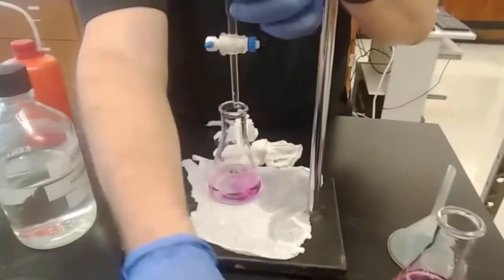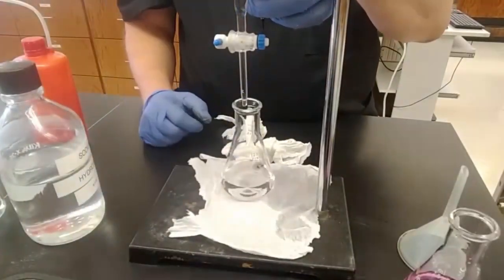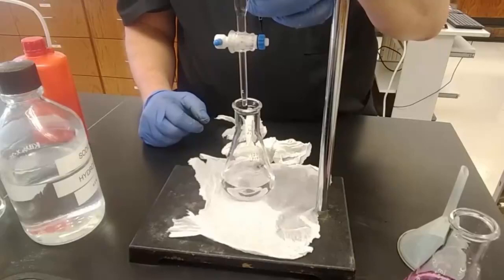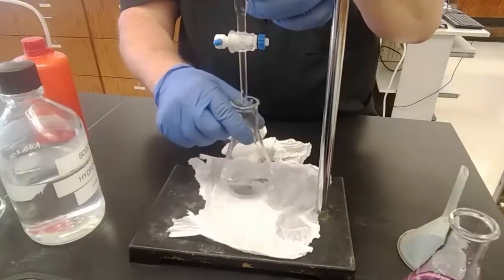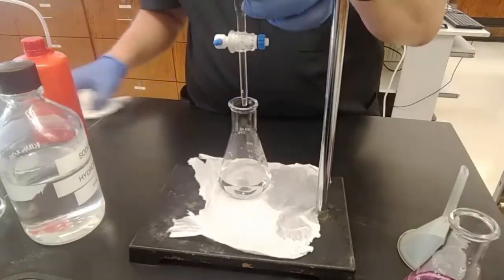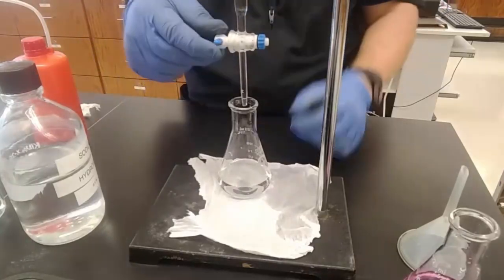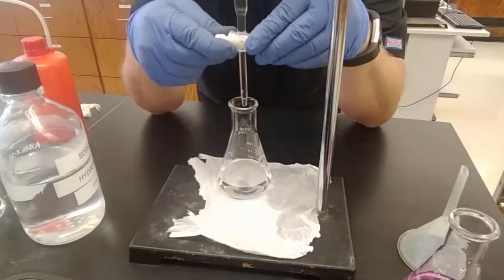Now you might think, oh my god, it turned pink. You missed it. Awful. But look at that. Science doesn't lie. Data can be misrepresented, but chemistry is chemistry. I knew how much was going to be in there based on my first 2 titrations. So now I can go really, really carefully at the end, just like I did last time.